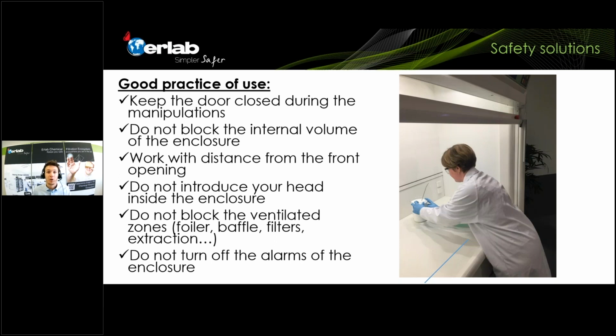So just to give you an example, on the picture here, you see my colleague working with a ducted fume hood. And actually the door of the fume hood is completely open. Of course, that's not a safe way to work with a ducted fume hood. Of course, it's the easiest way. It's very handy to work with an open door, but there is a false idea of safety when you do that. So really do not open the door, because the airface velocity will be too low.